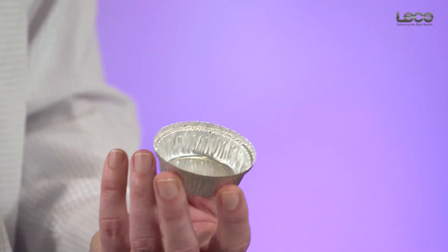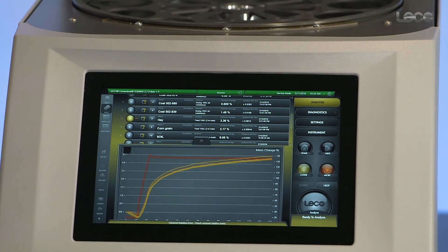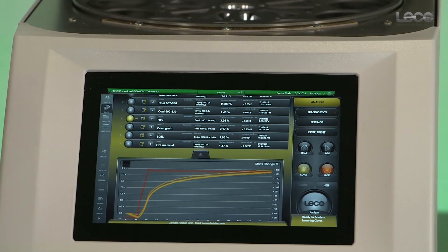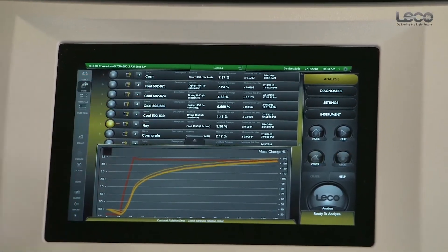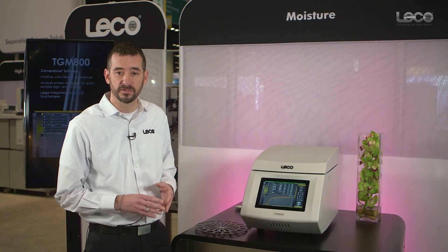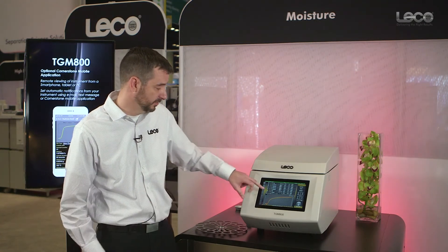The instrument settings indicate whether we're using the one and a half inch or the 2.4 inch crucible. On the software side, the TGM utilizes a full version of LECO's Cornerstone software, organized in a sets-and-reps approach. All replicates are organized into one set, and that set's analysis is automatically calculated for average, standard deviation, and relative standard deviation, as well as other applicable statistical calculations.